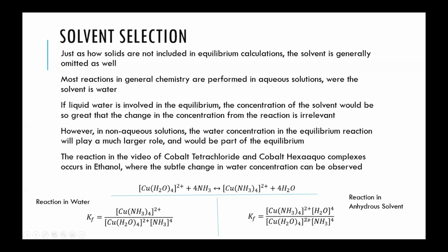And this is where solvent selection really plays a role, because if you were using a solvent that's in the reaction in one way or the other, it's really going to change the equilibrium conditions and those equilibrium ratios.